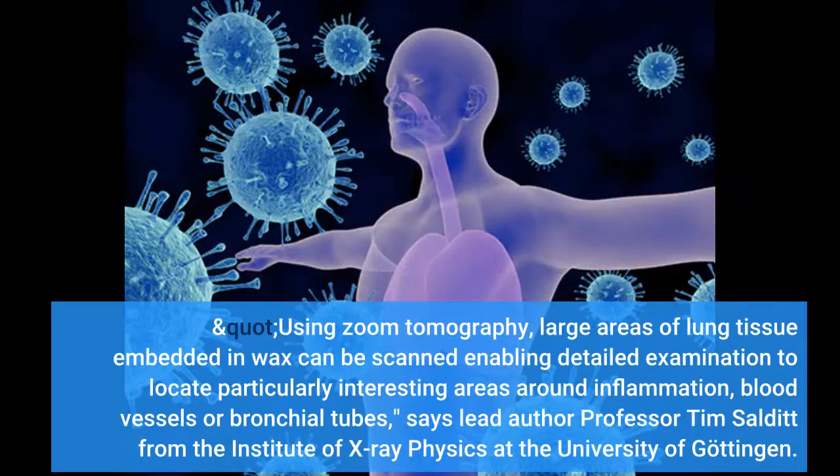Using zoom tomography, large areas of lung tissue embedded in wax can be scanned, enabling detailed examination to locate particularly interesting areas around inflammation, blood vessels or bronchial tubes, says lead author Professor Tim Salditt from the Institute of X-ray Physics at the University.